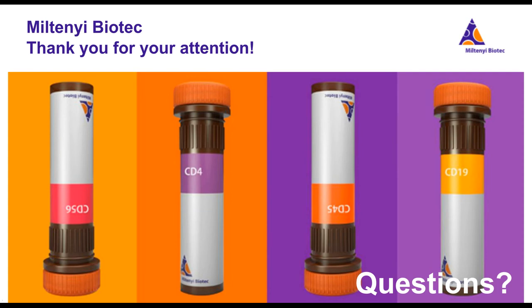Like I mentioned during the presentation, we just started with this project. Our aim is basically to test as many panels as possible that cover different types of cells, immune cells, and also other cell types from primary origin. So far, we have tested roundabout 34 panels, but we aim to test more and include more species, and also different sample origins from different tissues and so on.